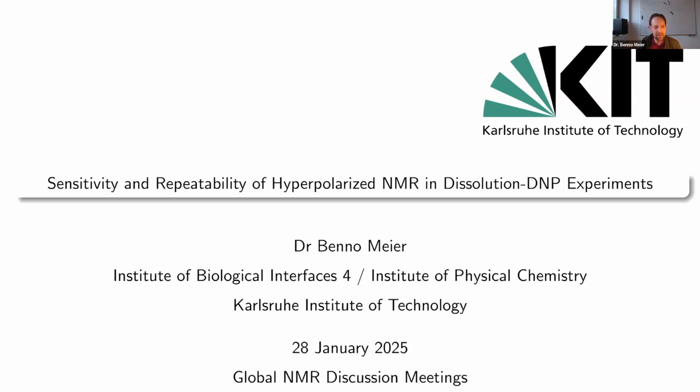So the title is Sensitivity and Repeatability of Hyperpolarized NMR in Dissolution-DNP Experiments. Really the talk has two parts, and the first one is about sensitivity essentially of normal NMR experiments. And then the second part, we will look at developments in hyperpolarized NMR, and more specifically dissolution-DNP type experiments, and even more specifically the bullet-DNP experiments that we run in our lab.